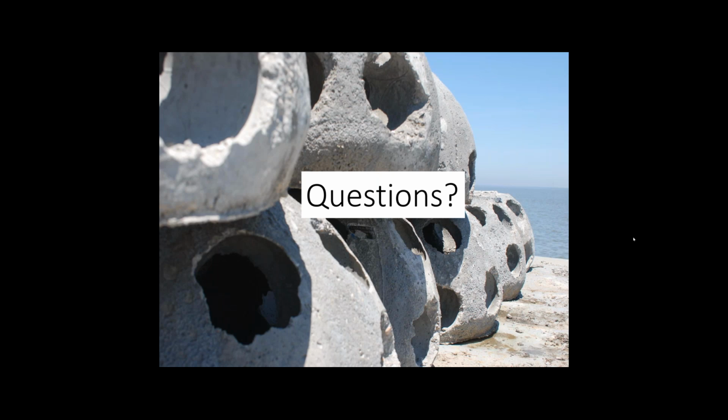Yeah, it's very difficult to do that. You have to apply enough weight, but that reef is really big, so even if it drifts somewhat, it's easy to get over that reef. But that's a challenge from the current perspective. We tried to put extra weight on the Van Dorn sampler, but of course that makes it more difficult to pull it up to the surface. That wasn't as much of an issue because that reef is so big. We didn't have to get it exactly on the reef, just in the vicinity, and we were still confident we got reef DNA from that.